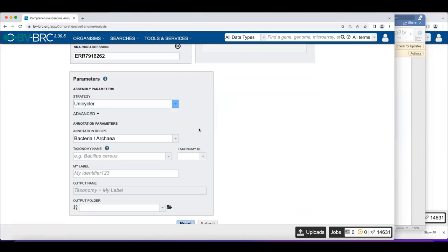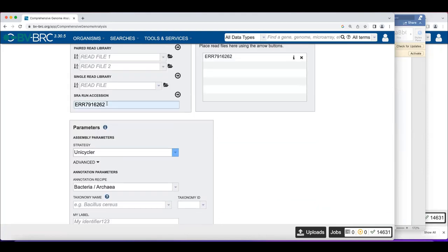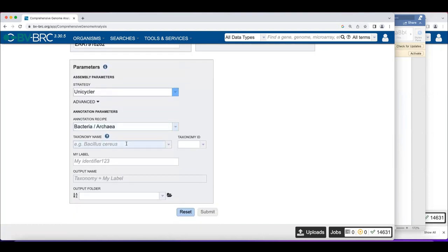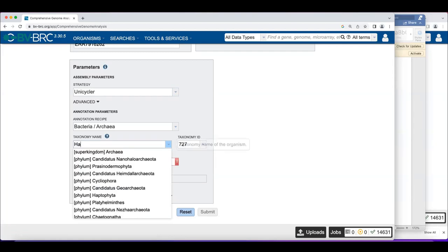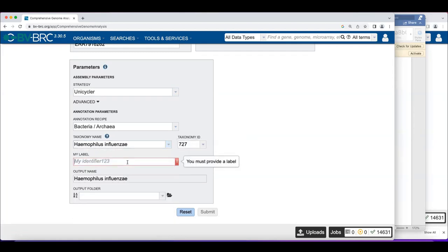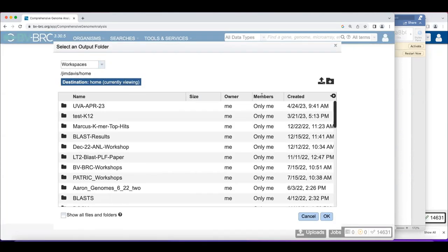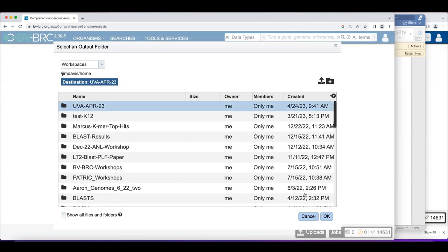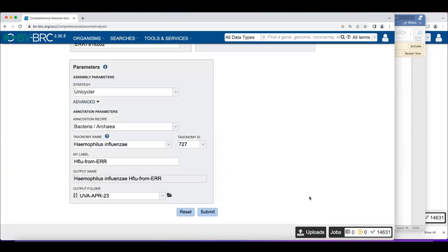To launch the job, you put your ERR number under the run accession, then the little arrow buttons push it over into the right-hand window — that's so you could potentially do multiple co-assembly. We'll use the Unicycler assembly strategy. This is Haemophilus influenzae, so I'll name it accordingly, put it in my workshop folder, and submit that job.